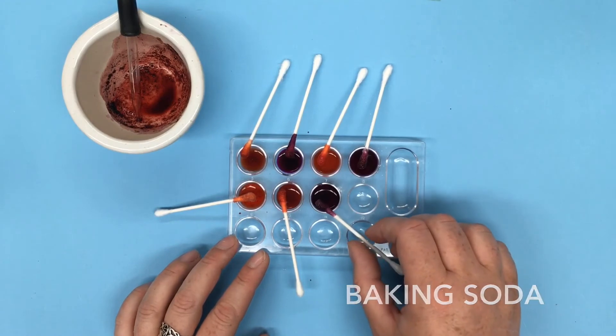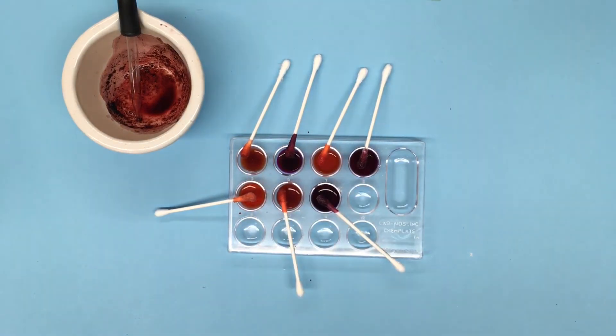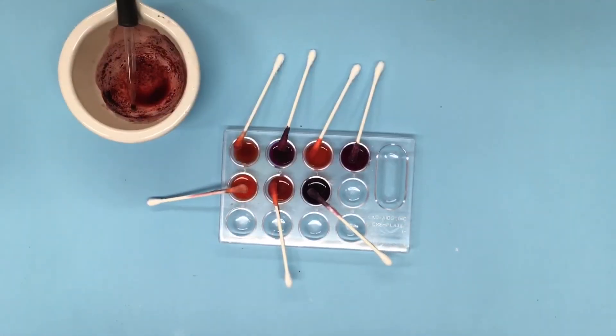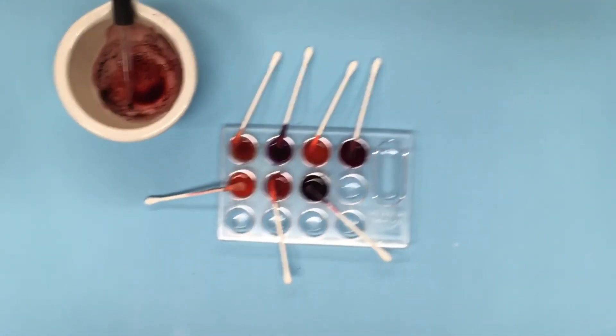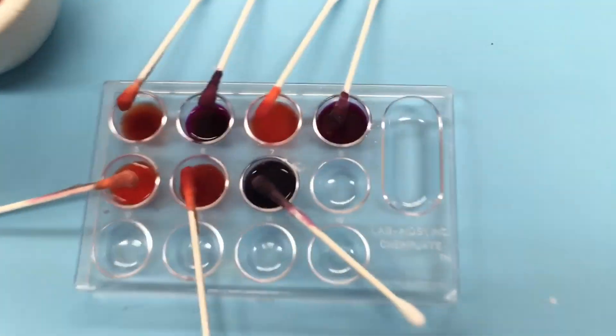So we can see that we're getting a variety of different colors just by changing the pH of the carminic acid in these bugs. And these can be used in fabrics, in food dyes, in all sorts of different materials. Okay let's just zoom in a little bit closer and take a closer look at those colors.